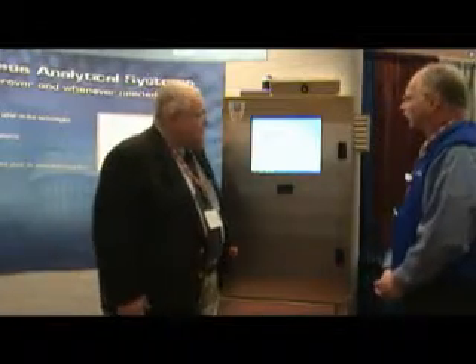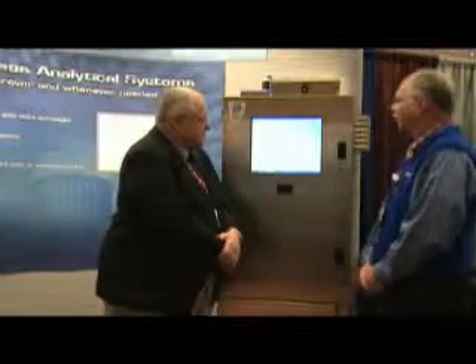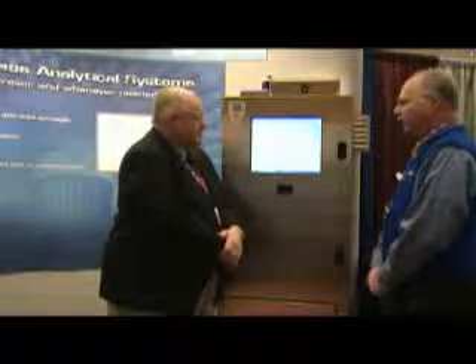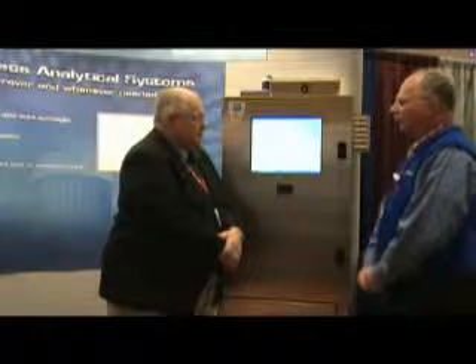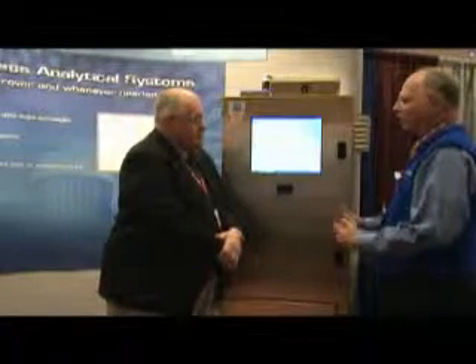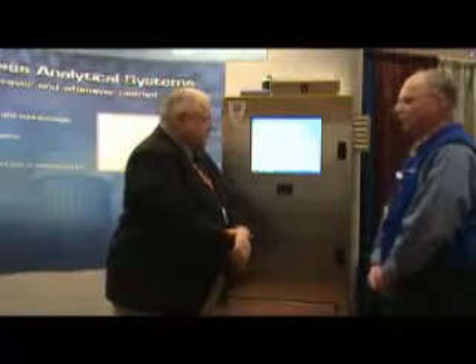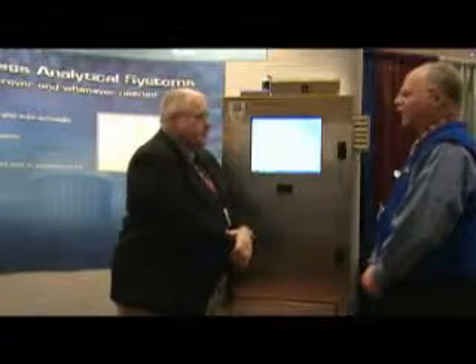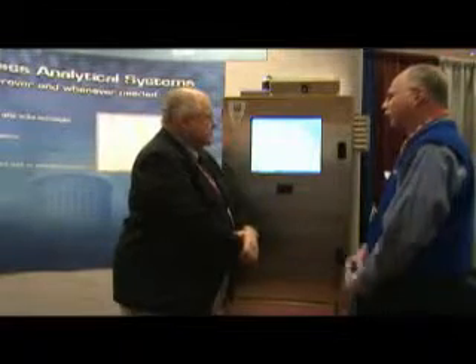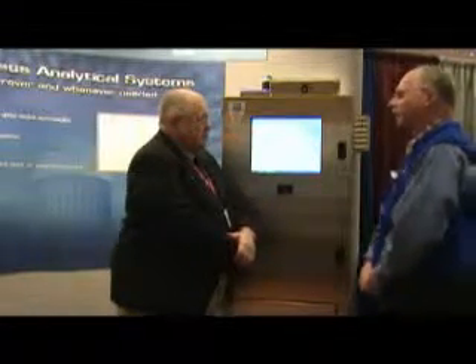One of the things that Dionics did this year — and Dionics has a long history in online LC, this being our 25th year — is this new product, the Integral, introduced in December of 2008. What we've tried to do is make a more versatile instrument than our previous ones, usable both in a laboratory environment and in production. We've modularized the functionalities — sampling, sample prep, and so on — into stand-alone boxes that work with lab instruments as well as in a full enclosure for online use in a process plant.